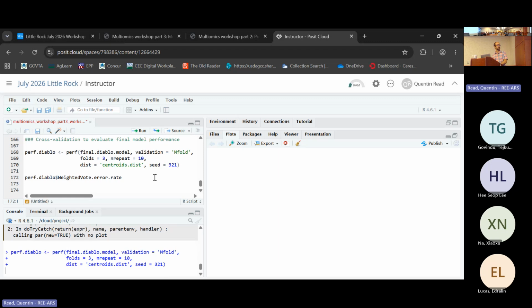I'm going to run that. But I just realized I should have a picture of the heat map in the lesson text, so I'm just going to show that instead of trying to save it to a PDF, because that'll be a pain in the butt. So I'm just going to show you it in a second.